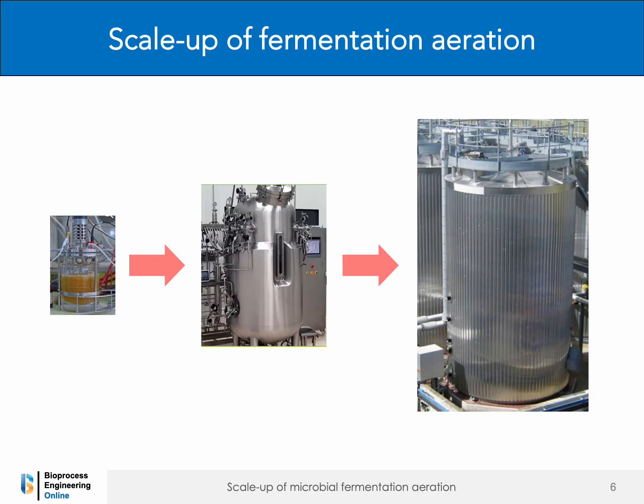During fermentation scale-up, aeration is often the most challenging aspect, as it becomes increasingly difficult to transfer sufficient oxygen to the culture. Inadequate aeration can lead to oxygen limitation at industrial scale, with detrimental effects on microbial growth, metabolism, and process performance.